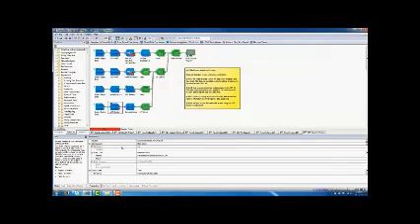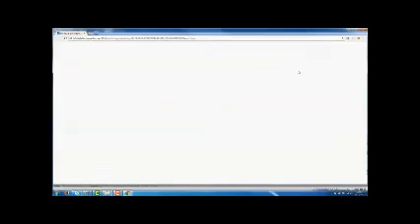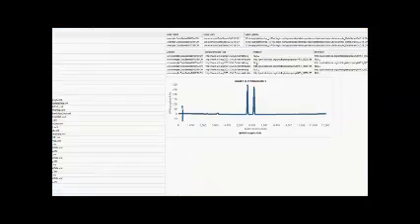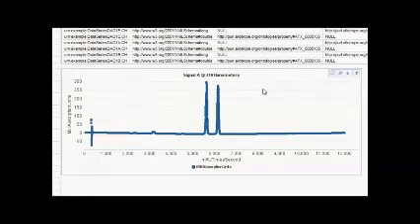We're then reading that ADF, and there's a bunch of different parameters in here. And for all the Don Rolfs in the room, we can go and look at this on the side, and you guys would be happy to see all the bits and bytes and stuff like that. But it turns out to tear that data apart into all of its package information, into all of its data, and all the different things that are in the ADF, and then it actually creates an XY chart of the XY data. And this is just one example of that. Of course, Pipeline Pilot can do all sorts of really cool things to visualize this data. This just happens to be a very simplistic view of the spectra.